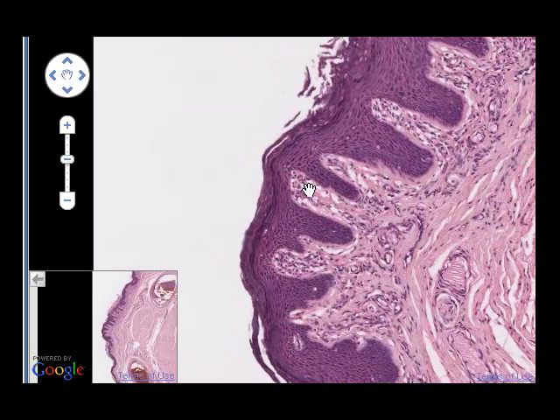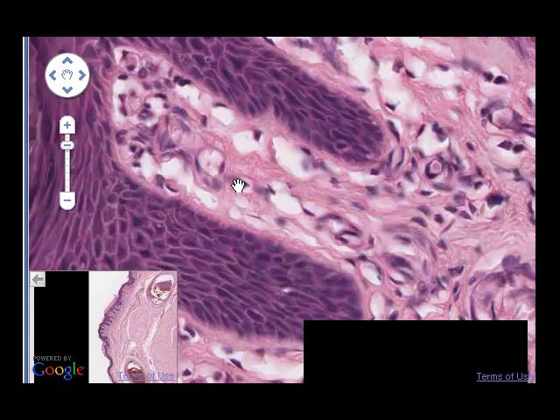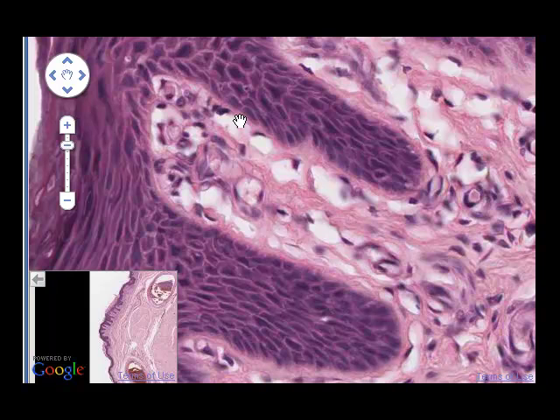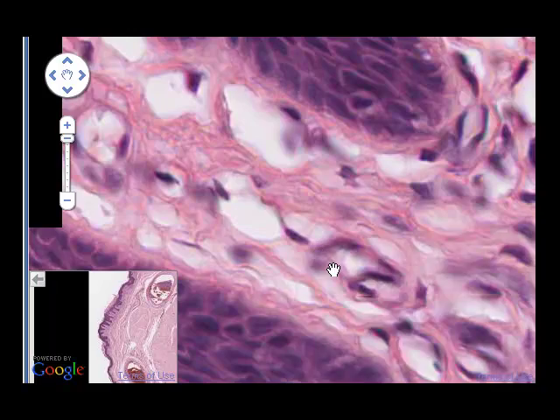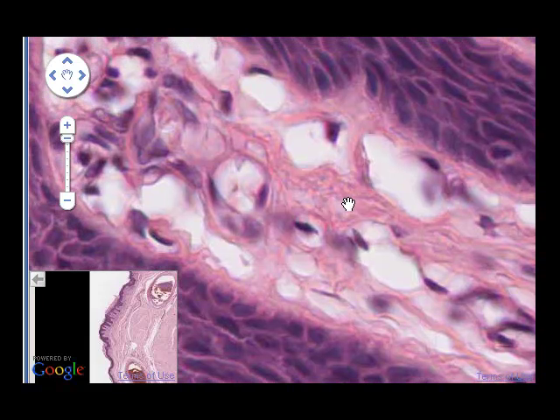For now we'll concentrate on these finger-like projections of connective tissue which interdigitate with the downfoldings of the stratified squamous keratinized epidermis. Close to the top magnification now, and here we can see what loose connective tissue generally looks like when it's found beneath epithelium. You'll notice a couple of things about it. The first is, at top magnification, you can make out collagen fibers. This tissue hasn't been stained specially to demonstrate elastic material, although there are elastic fibers present. You can't see them. So the fibers visible here are predominantly collagen type 1 and collagen type 3.